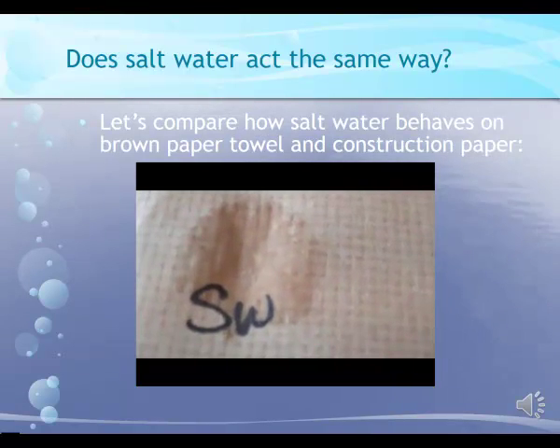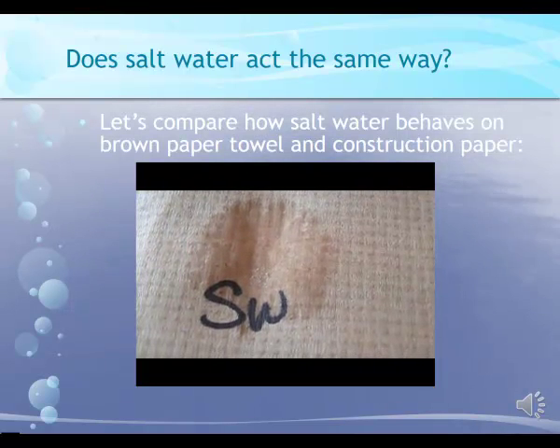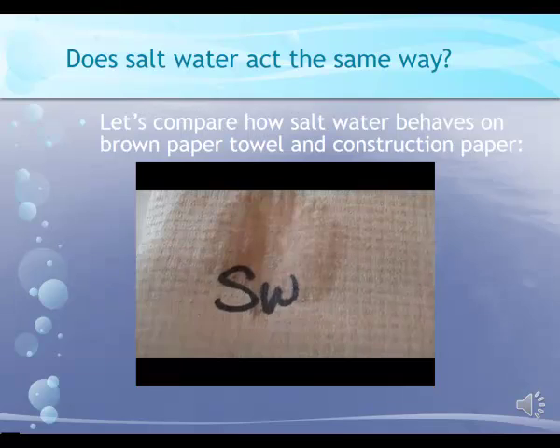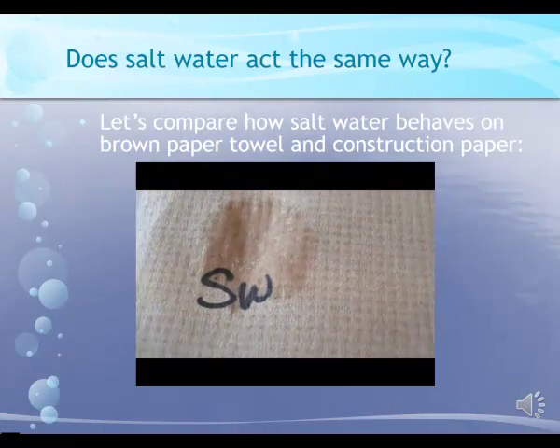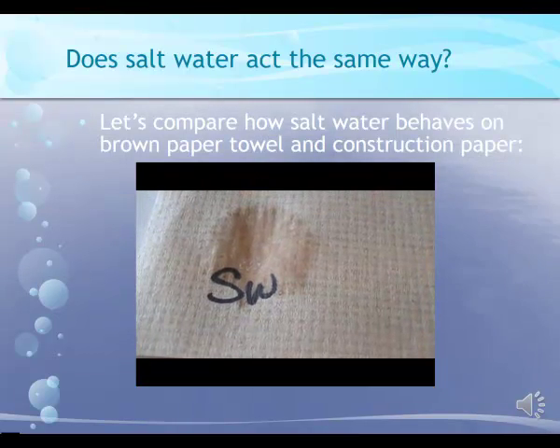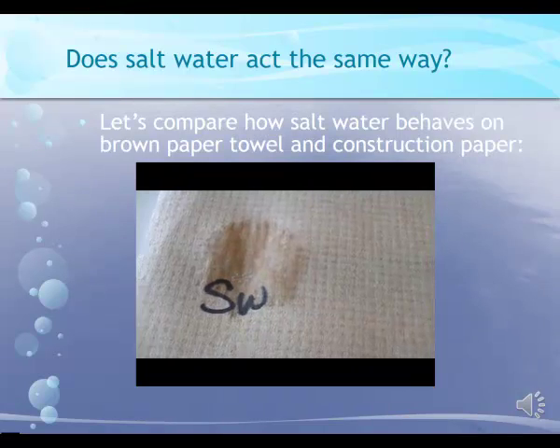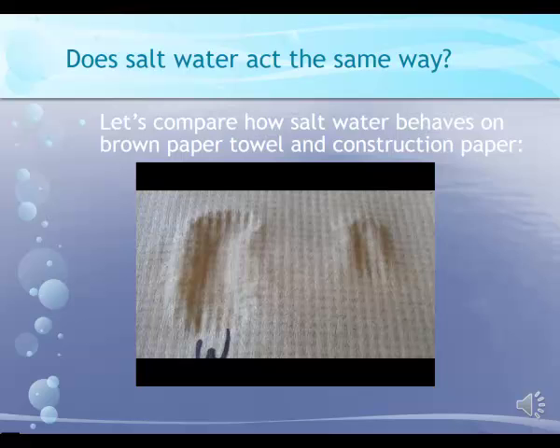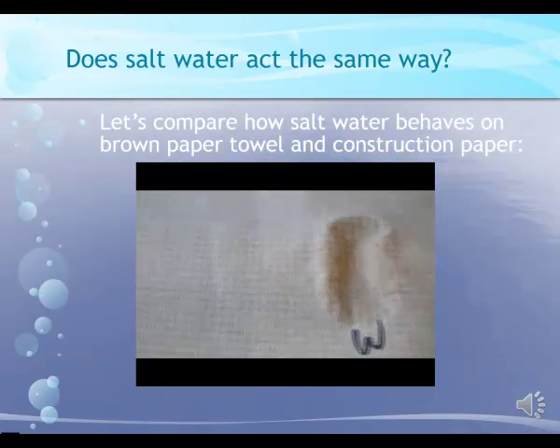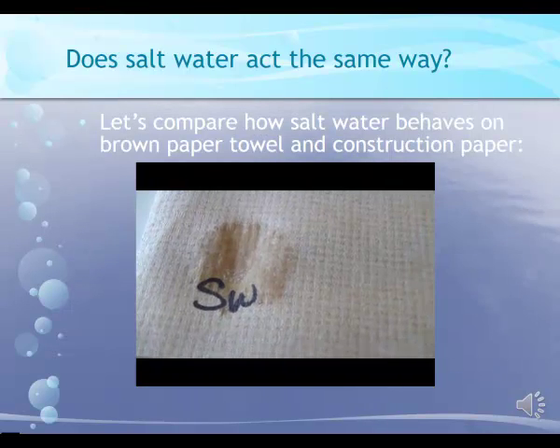However, if you can see, as the water evaporates, do you see the salt is left behind? There's some white crystals kind of right in there. So the water is gone and you're left with a white residue. So I need to write that down on my sheet, because just pure water, tap water, there are no crystals. There's nothing left after the water evaporates. So that's something that's a little bit different.